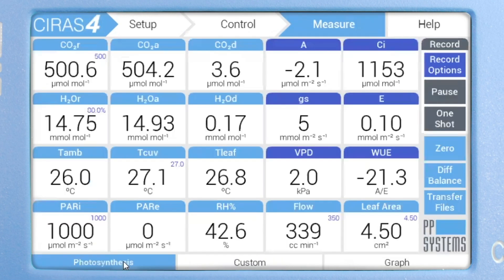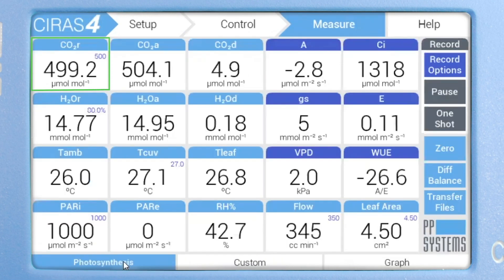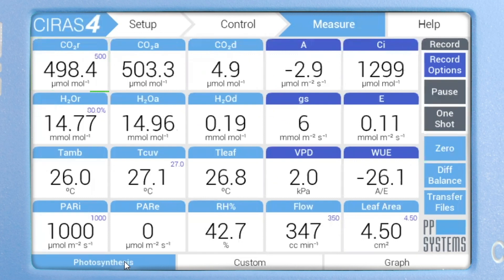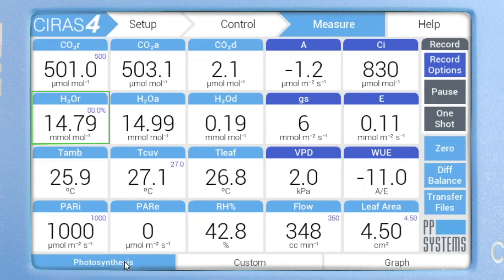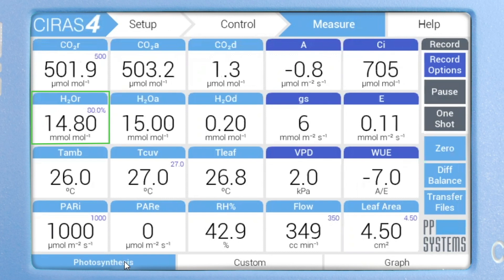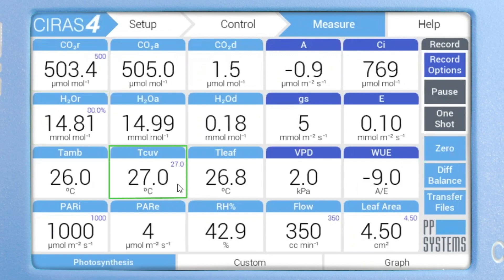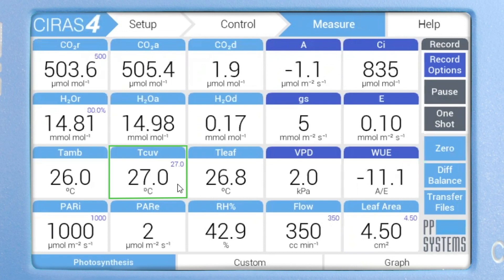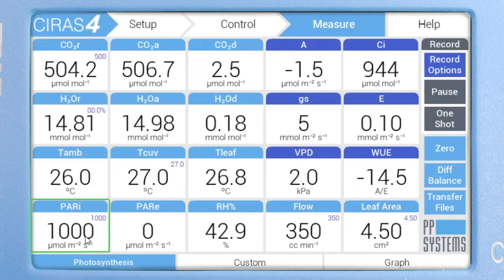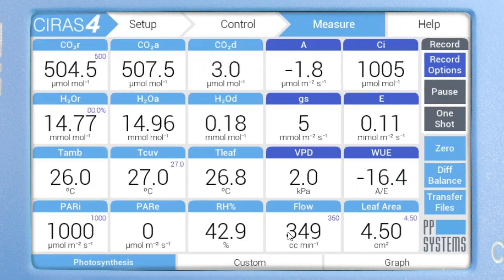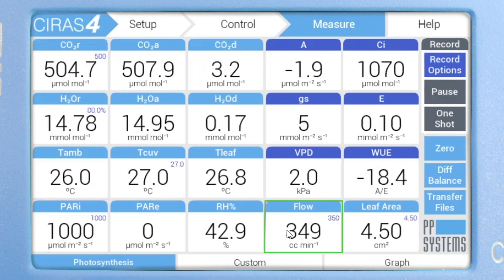Navigating back to the main photosynthesis screen, you can now see that our reference CO2 concentration is reading approximately 500 micromoles per mole, and our H2O concentration is reading at 80% of ambient based on this location. You can also see that our cuvette temperature is controlling at 27 degrees Celsius, our light intensity at 1000 micromoles per meter squared per second, and our cuvette flow rate is at 350 cc per minute.